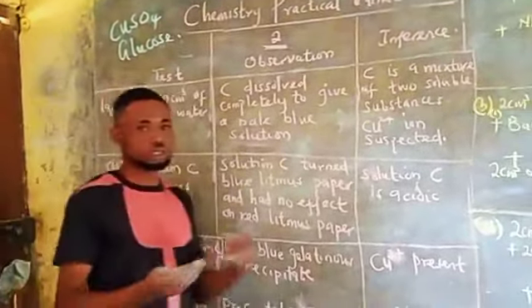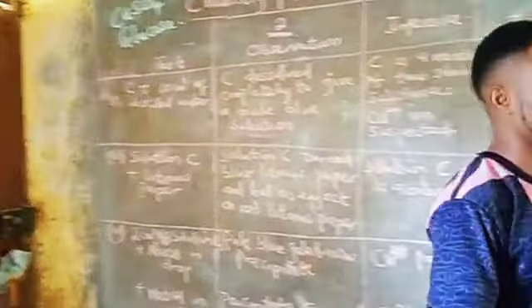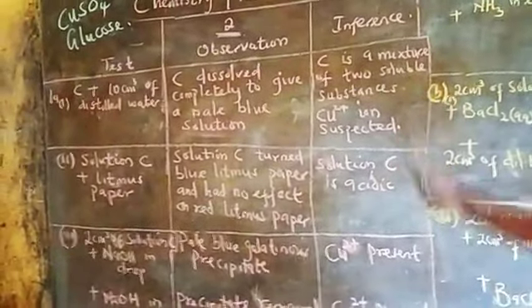Now, we are going to run analysis on copper sulfate and glucose.